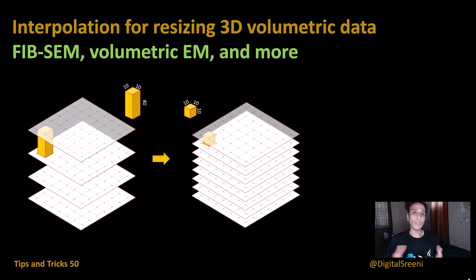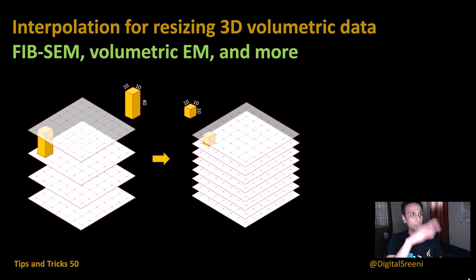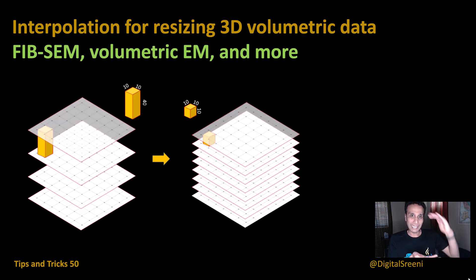Your downstream analysis may require you to change this volume to an isotropic volume, so the voxel size has equal dimensions in all x, y, and z. This video is for you — we're going to take this 10 by 10 by 40 and interpolate it by adding more slices. We take intensities from one slice and intensities from the next, and interpolate based on the distance between them.